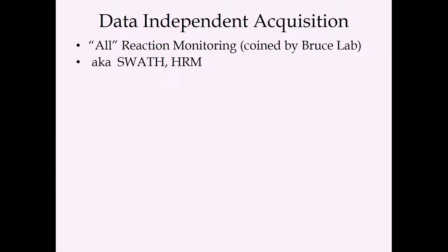Of course, it's got other names, SWATH and HRM. And I think the way to describe this is basically like Kleenex and tissue, so they both mean the same thing. Some of them actually are trademark names, some of them are not. But they do add a little bit of confusion to the field, and they all have slightly different nuances. So sometimes people say SWATH can only represent things that are being done on SCIEX QTOF instruments, etc. So I personally like the name data independent acquisition, largely because it's a little bit more general and broad.